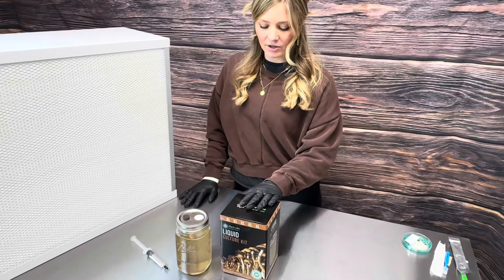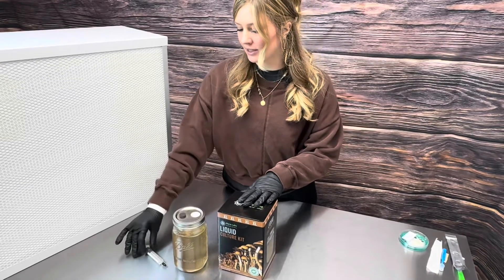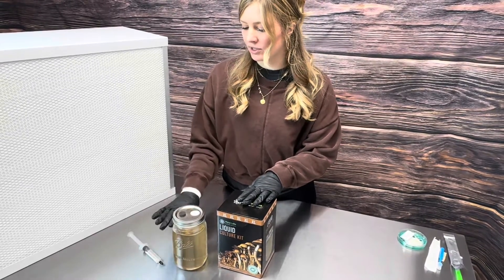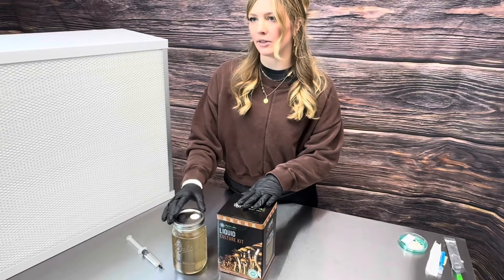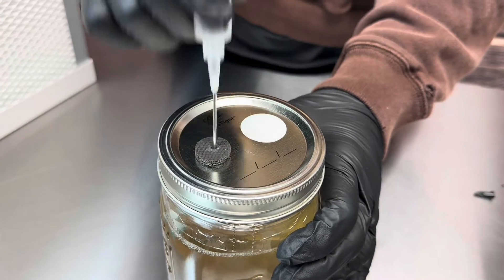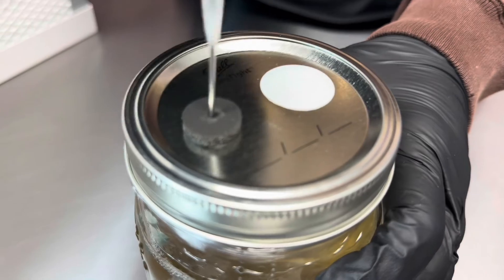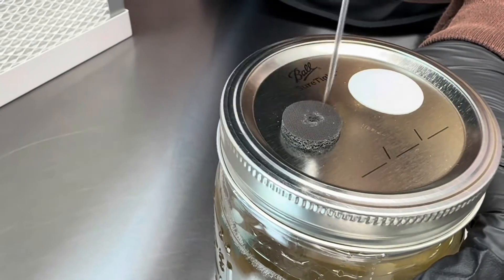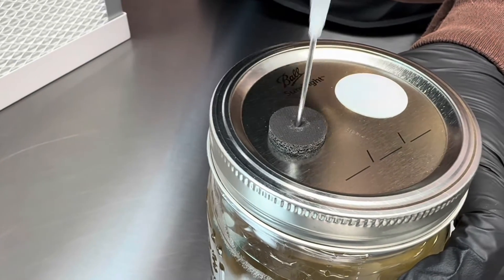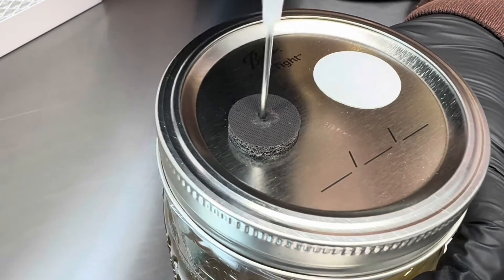When using the extra-large liquid culture kit, our team has gotten up to 50 10 cc syringes from it, and with the regular sized one you can get about 30 liquid culture syringes. A little tip: if you're drawing up multiple syringes, try to create a new hole each time rather than reusing the same hole, because then your port will no longer self-heal.